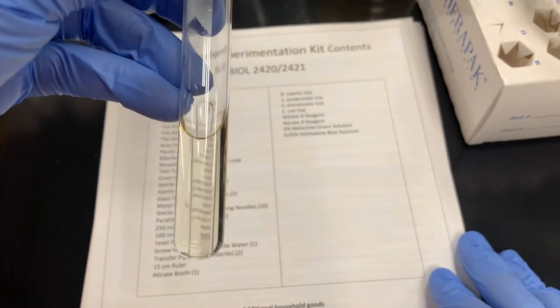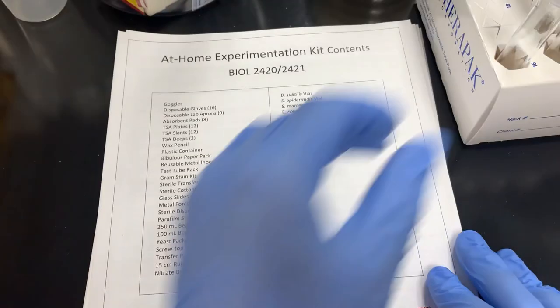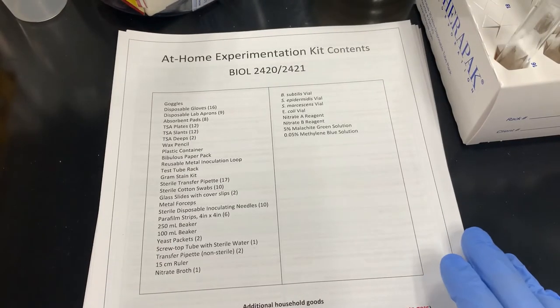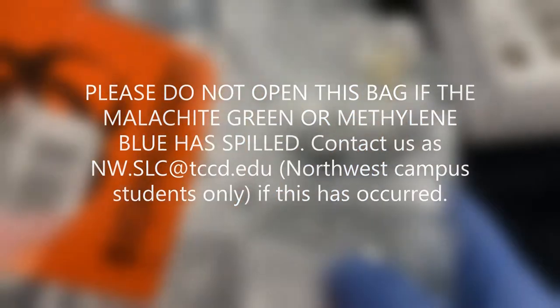Okay, this is the nitrate broth. You might want to label that if you're watching this video. This is nitrate broth. Then we go to this nice little baggie. Okay, this says biohazard. Guess what? It's a biohazard. Please be careful when you're using the stuff in this bag.